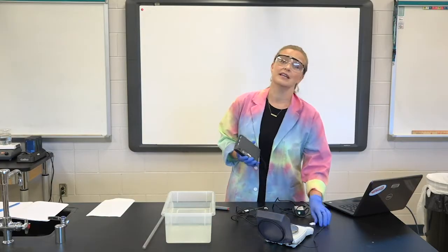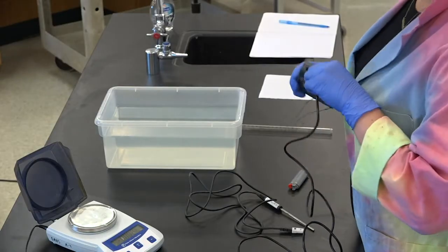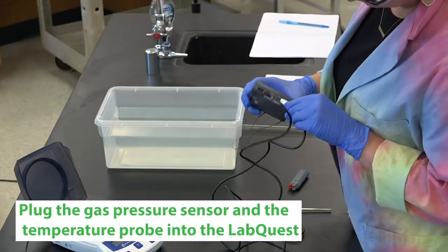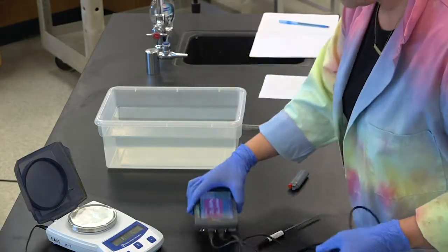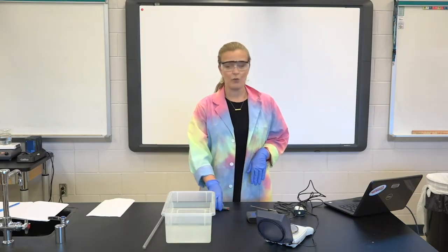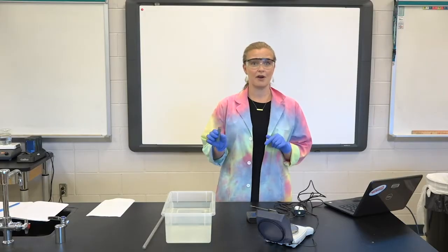We are also going to need a temperature sensor and a pressure sensor for this experiment, so I'm going to snap those into my LabQuest. That'll give us a temperature before and after and the pressure throughout the lab. We also are going to need to get the mass before and after the experiment.